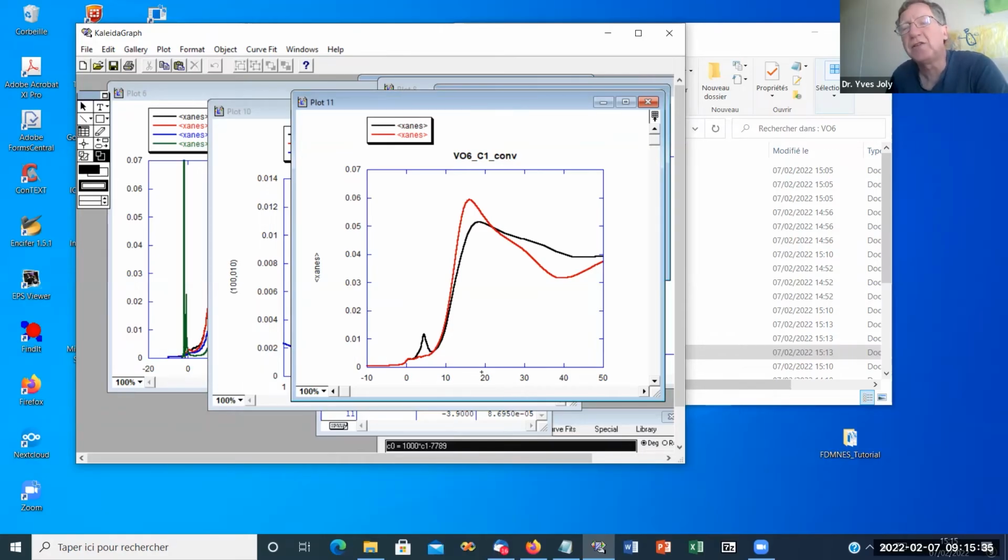And if you increase the temperature, it's a case, for example, in titanium dioxide, in rutile, in fact the pre-edge increases. It's due to the fact that now what you see is not only the quadrupole effect, but also some dipole effect. In fact, this pre-edge is dipole. It's why it's big. A quadrupole is always small. And the pre-edge increases here because you lose the center of symmetry.